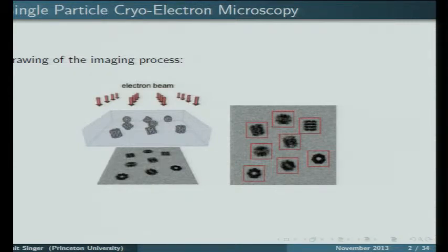Okay, so what is cryo-EM? Cryo-EM is a technique for finding three-dimensional structures of molecules that cannot be crystallized. Many of you perhaps know that X-ray crystallography is the best known, and in the last few decades there have been numerous Nobel Prizes associated with this technique for getting structures of molecules. But unfortunately, there are many molecules of biological interest that people have no idea how to get to crystallize. Then we need alternative techniques, and cryo-EM is one of those alternatives.